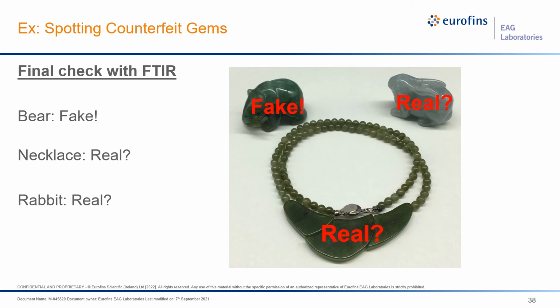A complementary technique, Fourier transformed infrared spectroscopy, or FTIR, was used to check for resin impregnation. FTIR exposes a sample to infrared light and can provide information about the chemical bonding based on what wavelengths of light are absorbed. We're using it here because resins and epoxies are amorphous and would only make up a small fraction of the total volume of these samples, meaning it's basically invisible to XRD. But FTIR works great for organic compounds and should be able to fill in for the limitations of XRD.